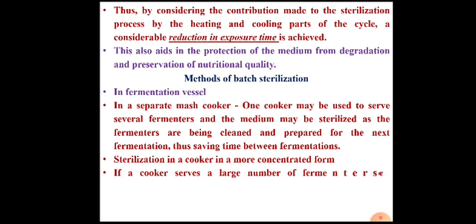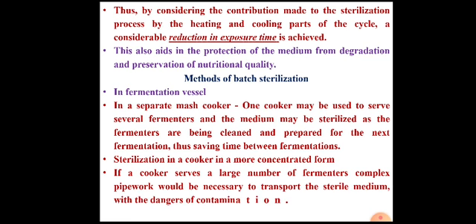And if the cooker serves a large number of fermenters, it needs complex pipe work. And if there is pipe work, there may be a risk of contamination. That is the limitation of this method of batch sterilization.